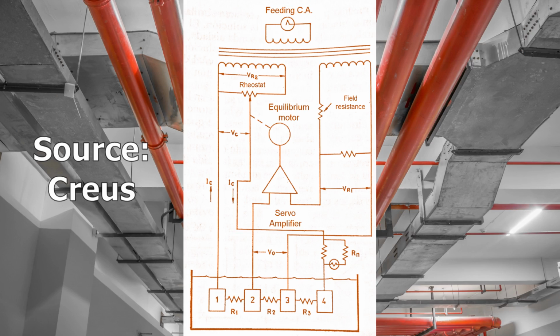The conductivity measurement requires compensation for the solution temperature in relation to the chosen standard temperature of 25 degrees Celsius. This compensation is usually automatic, consisting of a thermistor and a resistor Rn. It is worth mentioning that the addition of a microprocessor allows obtaining, by hardware or software, potentiometric conductivity circuits with different characteristics, since it has conductivity tables in memory. Their measurement accuracy is plus or minus 0.5%, and the measurement range reaches a maximum of 0 to 150,000 micromhos.